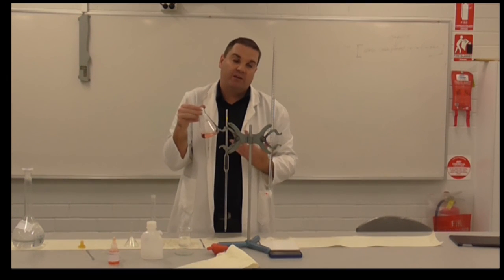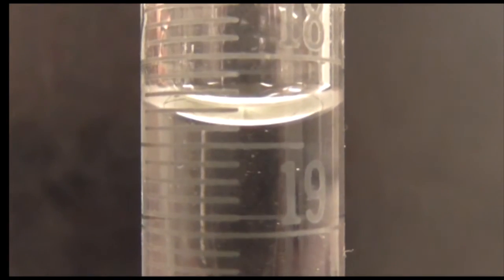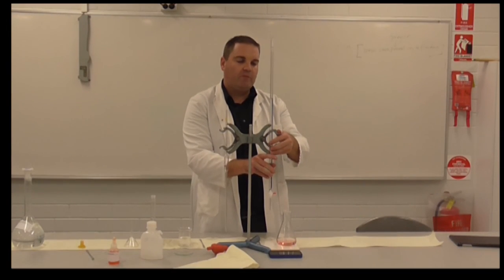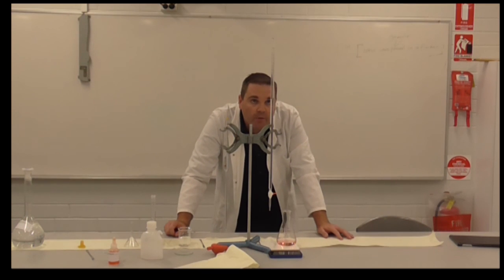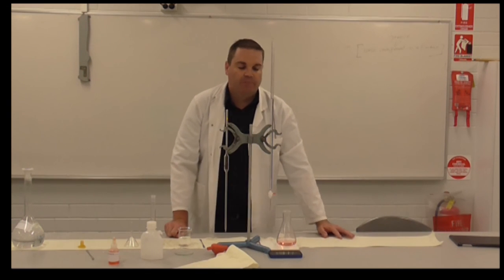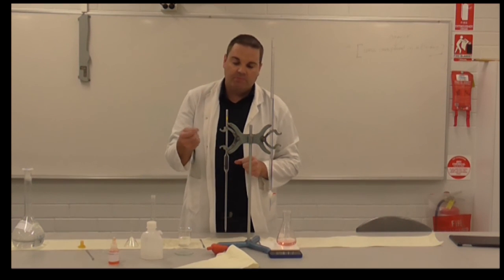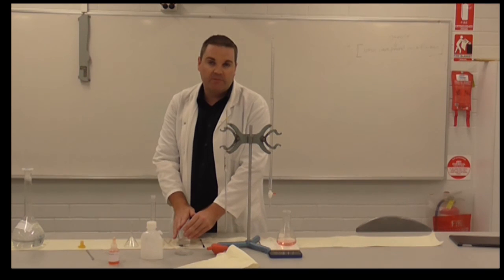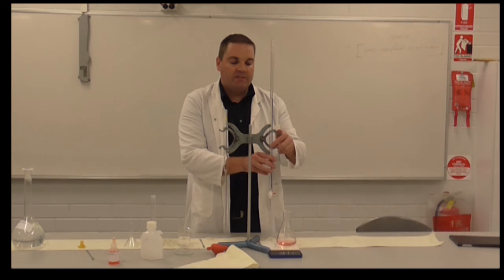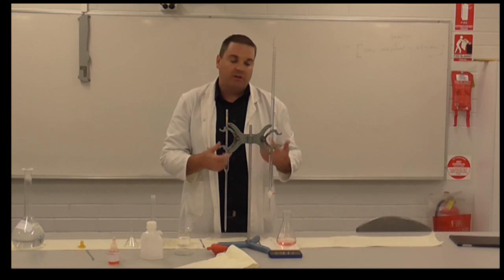This is the first titration, which is what we call the rough titer — we're just trying to look at roughly the value we get to. Reading off at eye height, I can see I'm on 18.4 millilitres. So my first titer value is 18.4. Now I take my conical flask, empty it down the sink, rinse it out with distilled water, prepare another 20mls of my standard solution back into my conical flask, and do another titration. I want to keep going until I get three concordant titers — that's three within 0.1 of a millilitre of each other — and then I can do my calculations.